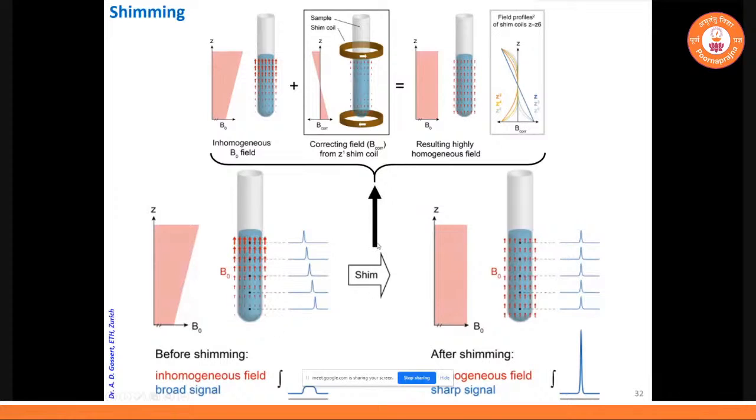That's why in NMR, along with the NMR coil, there are shim coils, almost 40 in different directions. We pass current through those coils and adjust the magnetic field. Finally, we should get a very homogenized magnetic field across the sample volume, so that we get only one line. Any frequency that comes then depends on its molecular environment, not on sample inhomogeneity.